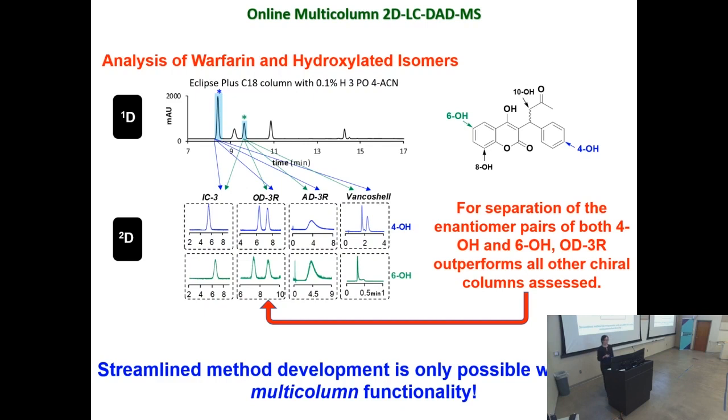So in this analysis, we can get the area percent for all the impurities, all the components in the first dimension. In the meantime, we can also get the enantiomeric excess, which is the EE value, for each component on the second dimension.